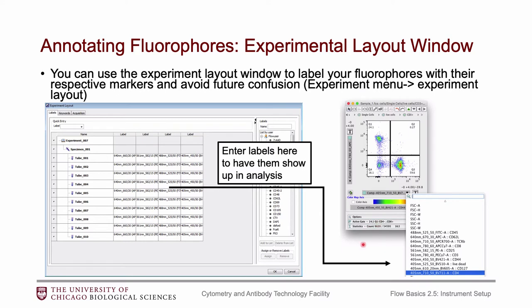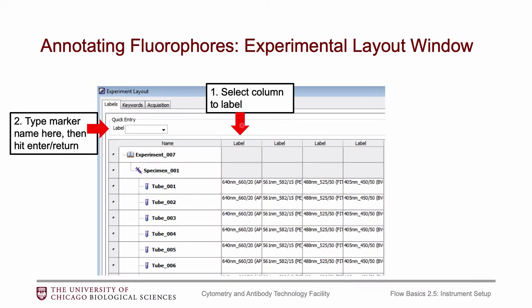Once you've selected your fluorophores, we strongly recommend labeling them. By default, detectors are labeled with laser, filter, and a generic fluorophore name — so in FlowJo you'll see that generic label. You can add your specific markers for the experiment and they will show up in FlowJo labeled appropriately. The way I prefer to do this is through the experiment layout window, accessible from the experiment menu. Once all your tubes are set up, select the column you want to label and type the label — for example CD45 or CD3 — and it applies to the entire column.